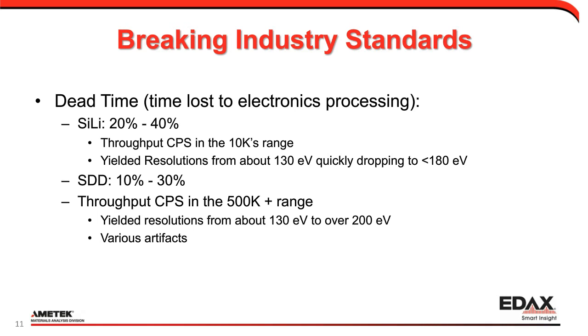But if we were really pushing the max output, we would be over 200 EV. It is a lesser focused on spec, but it is out there. So that's always a good question to ask: what is your resolution at your fastest processing time as you're looking at your detectors?